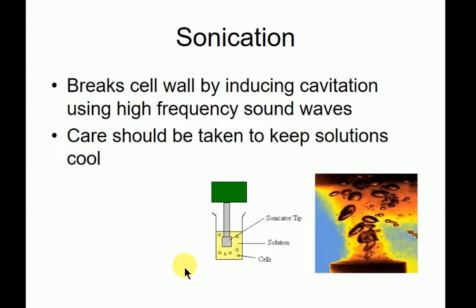And if you're good like me, you'd be doing this in a small room, and you'd place a set of ear protectors on the door handle so that anyone who comes into the room doesn't get a blast of sound waves in their ear. And so you protect your own hearing.